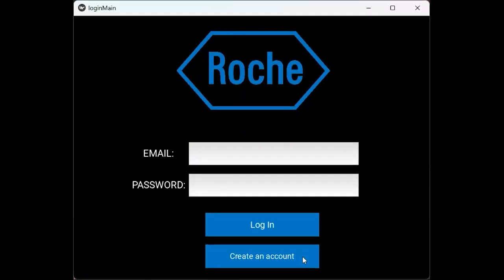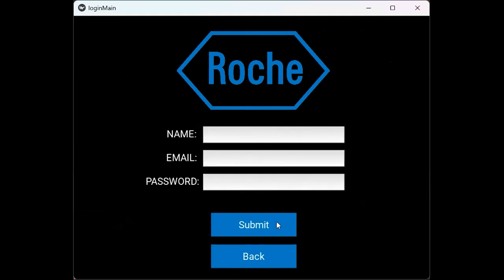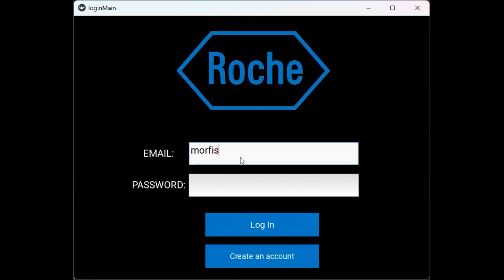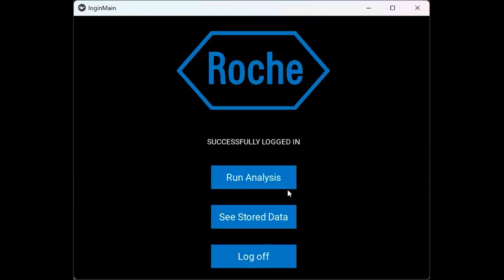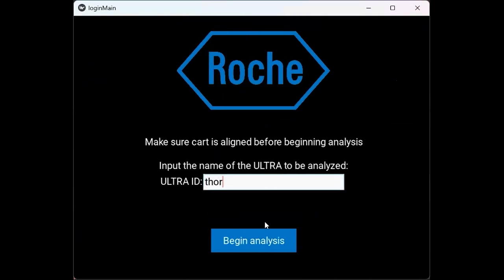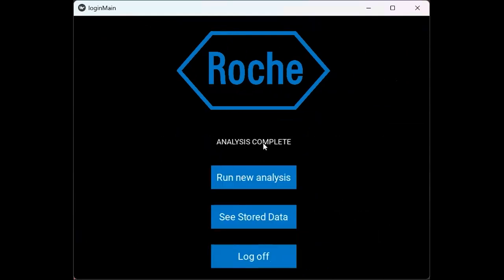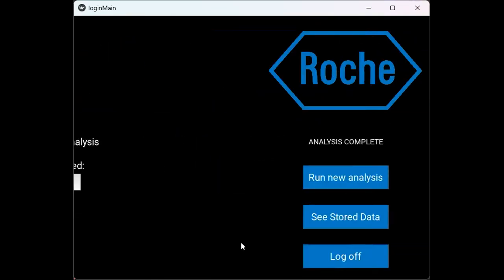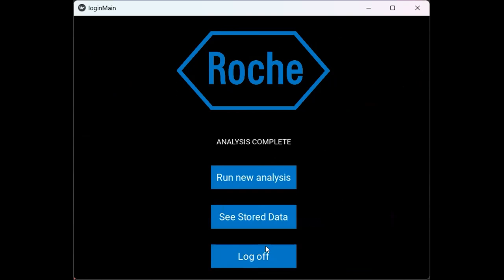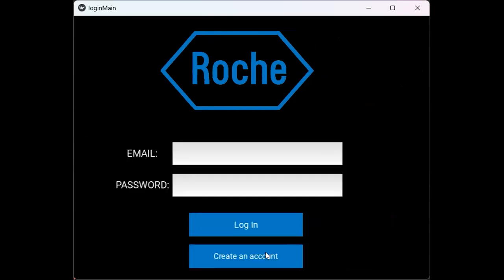This interface allows the user to create an account using their name, email, and a chosen password. Once the account is created, the user can log in to the platform. After successfully logging in, the user will encounter three buttons: one for running analysis, another for seeing stored data, and the last one for logging off. Once the user clicks on running analysis, a message is displayed reminding the user to double-check that the cart is correctly aligned with the device. The user then inputs the name of the device to be analyzed and clicks begin analysis to run the fluid detection. When the analysis is finished, three buttons are displayed: one for running another analysis, one to access stored data, and one for logging off.